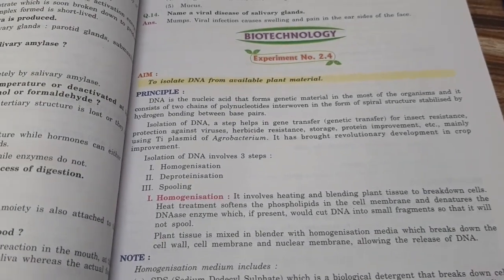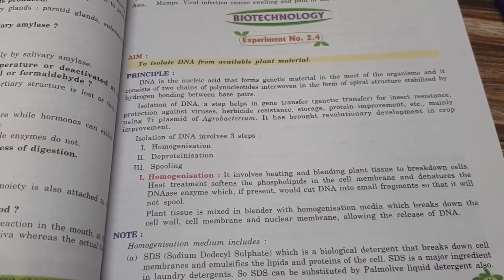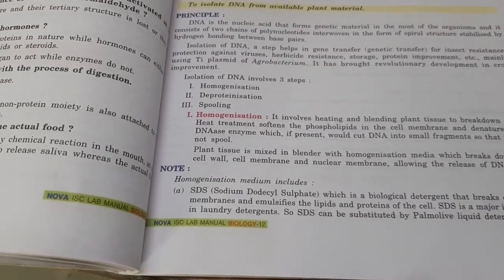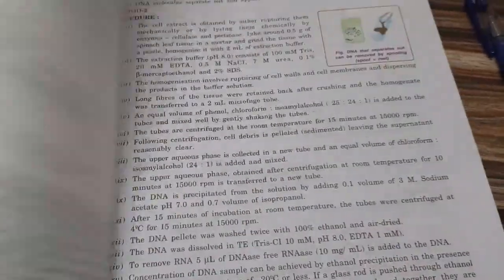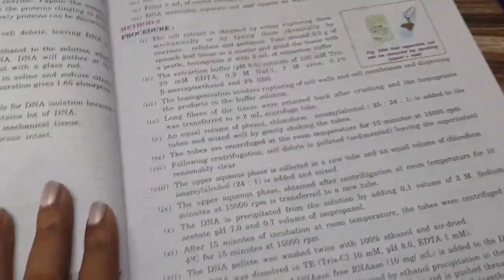So class 12, the next practical is to isolate DNA from available plant material. Here we are using isolation of DNA from banana, which is the most available thing in the market. We are using the banana and doing the method 2 procedure.